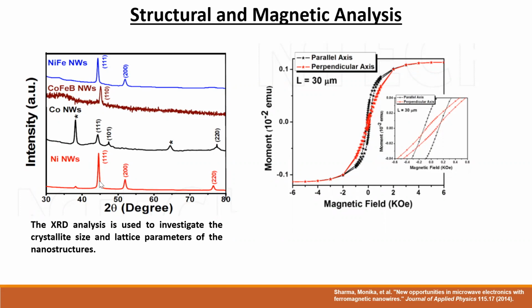Corresponding to the structural parameters, in the XRD, we get different reflection planes. Depending upon whether we have multiple reflection planes, we have a polycrystalline material. If we have a broad peak, that corresponds to the amorphous phase. And if we have multiple reflection planes, but corresponding to multiple orders like 100, 200, 300, 400, that belongs to a family of 100 planes. So that is the single crystalline material.